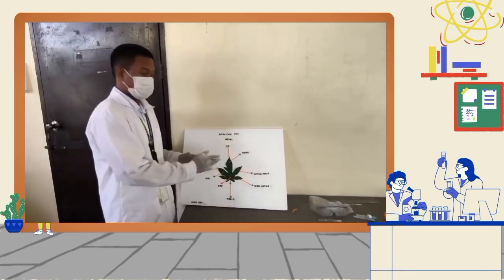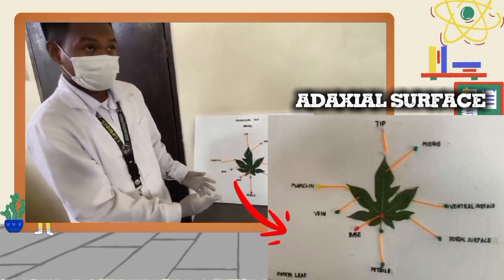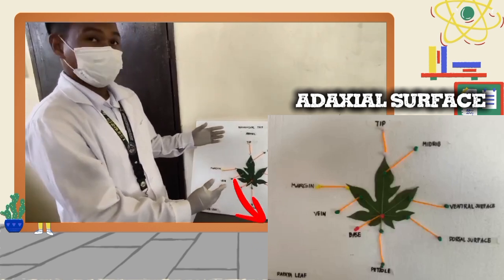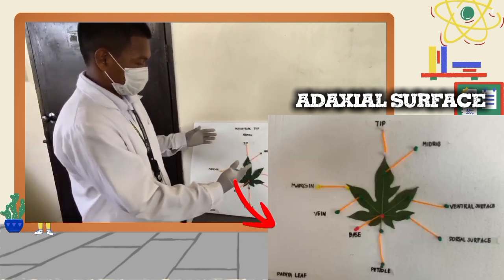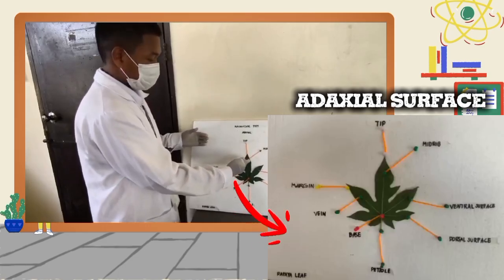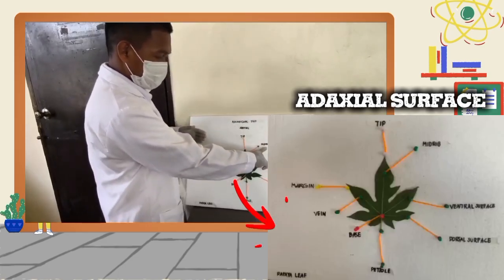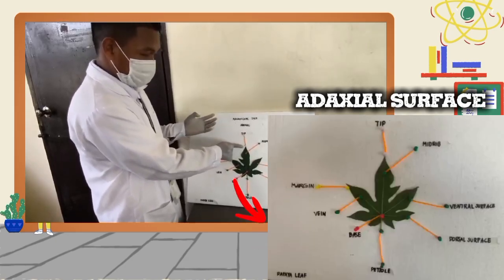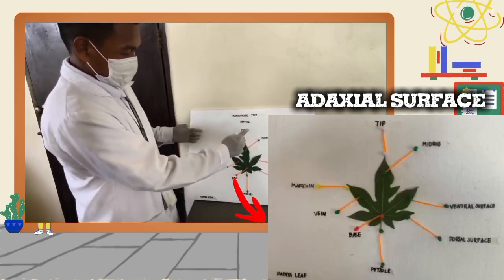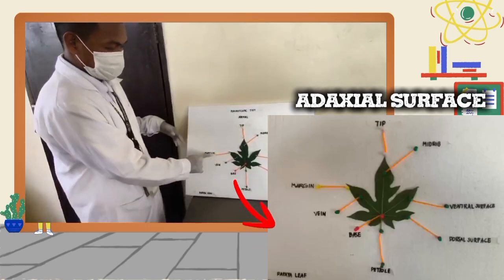It's basically the same, nothing has changed. And the third specimen, we have here the papaya leaf, the adaxial part of this specimen. We have the upper part of this papaya leaf. We have the midrib, and at the upper top of the midrib we find the tip. And on the right and the left side, we have the margin.